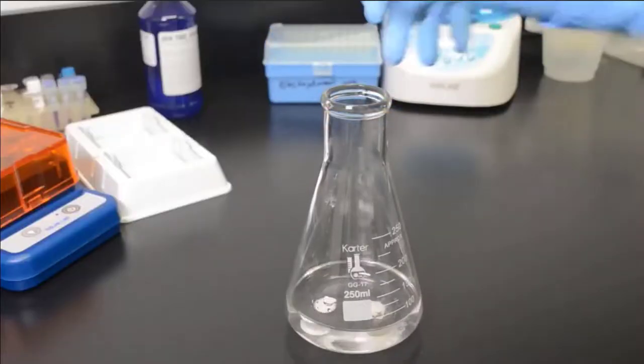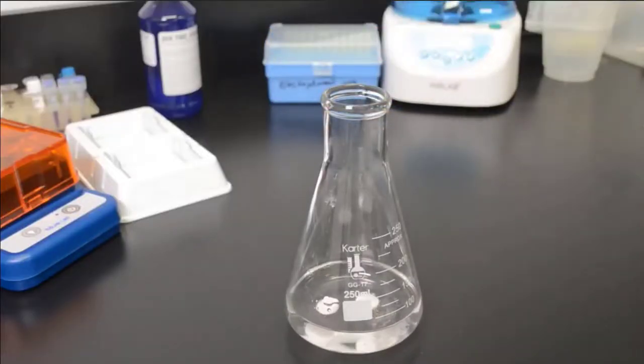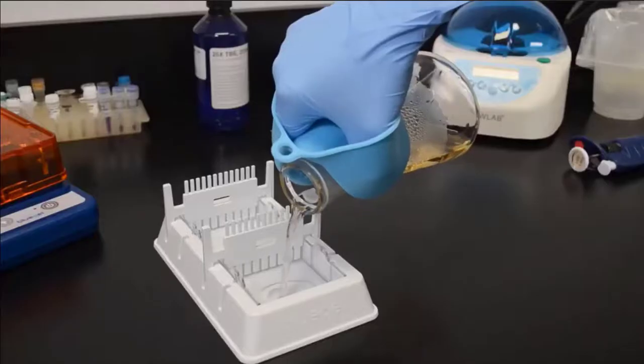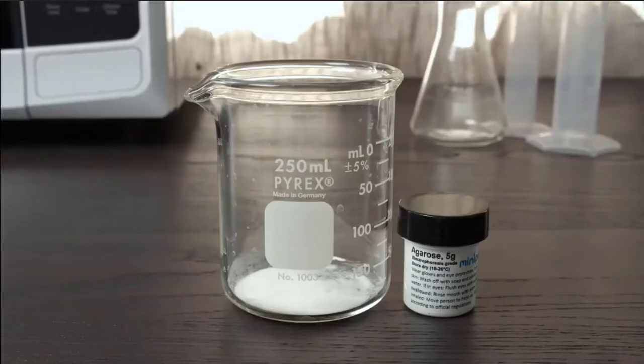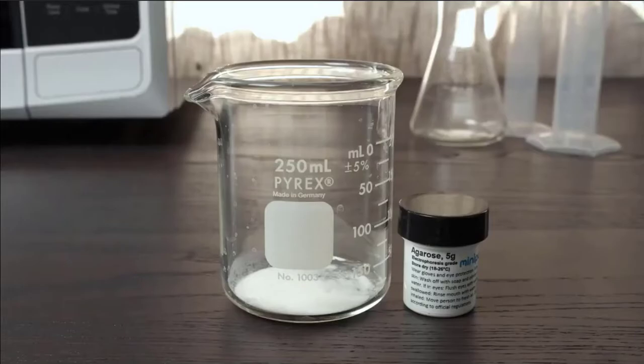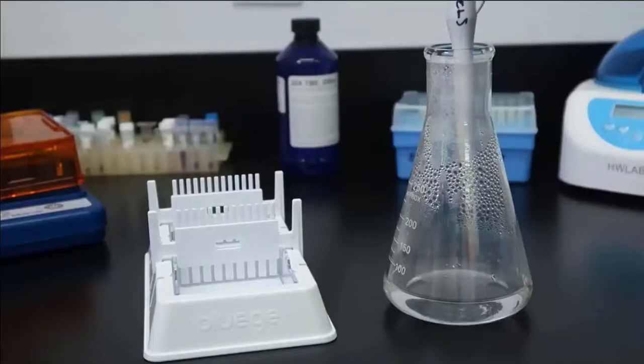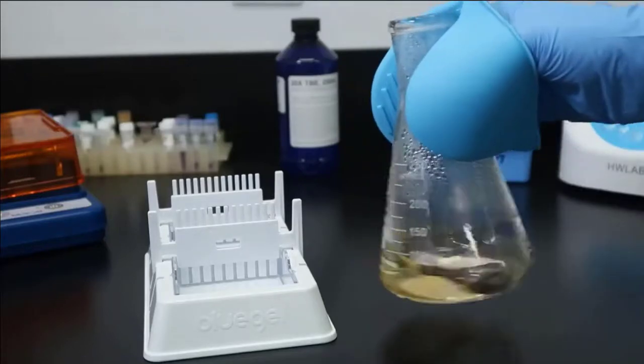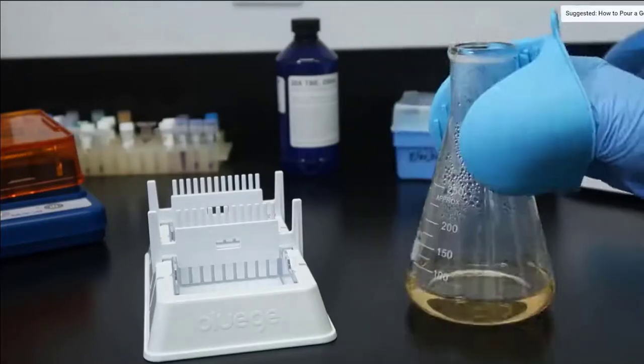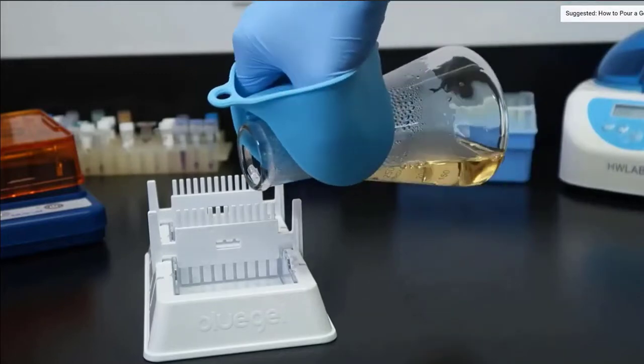To create an agarose gel, we dissolve agarose in an electrophoresis buffer, boil it, and add it to a gel casting tray. Typically, agarose comes as a powder, but it also sometimes comes as a pre-weighed tablet. We usually also add a DNA stain at this step to make visualization of our samples easier later on. To learn more about gel pouring, you can watch our How to Pour a Gel video linked below.